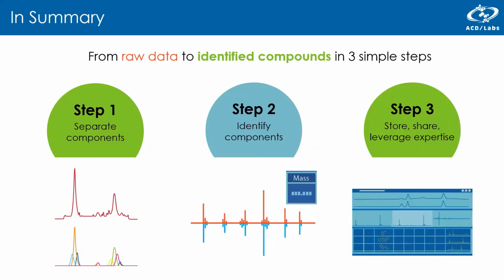The second option that we used was to generate a formula and do a search by mass with the flexibility to have an include or an exclude list. And then finally, we talked about how you can store this information into the database.